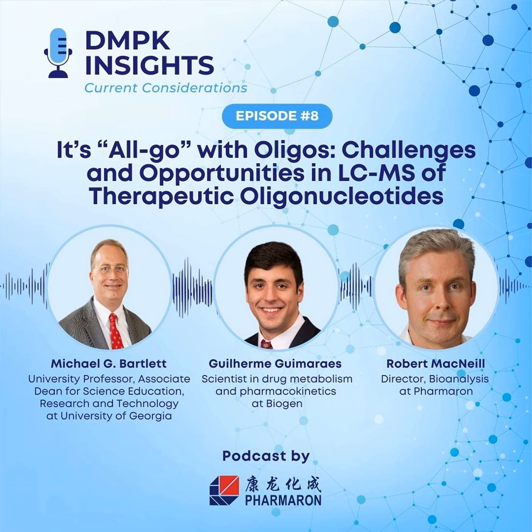In particular, because the retention mechanism for oligos in HILIC appears to be very different than traditional HILIC mechanisms as well. Because again, everybody believed it's that water layer in HILIC, that you have that partitioning into it, and it does not look like that's going to be a very significant part of the oligo retention mechanism, because again, we're using too much water in most of the HILIC methods to effectively have that water layer there as well. And so I think we're going to have to really work through that, because again, it looks like it's going to be much more of a hydrogen bonding and a little bit more of an ionic mechanism there.